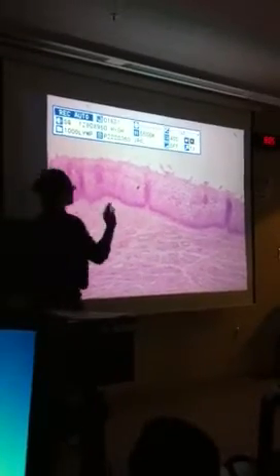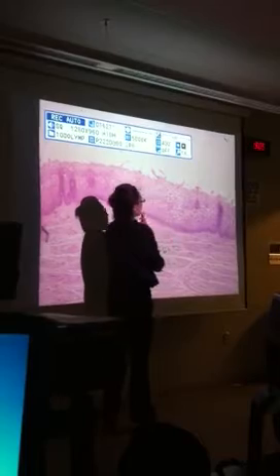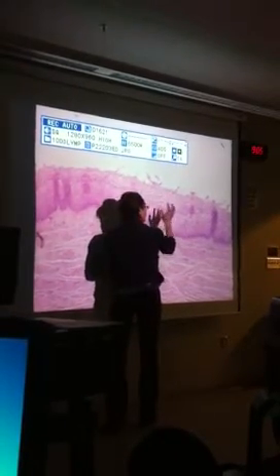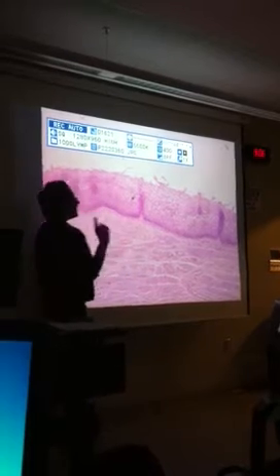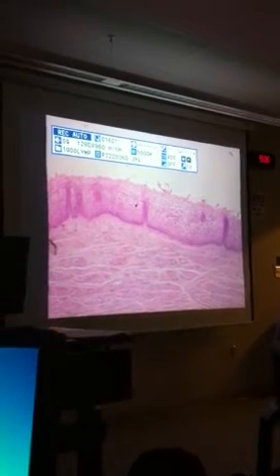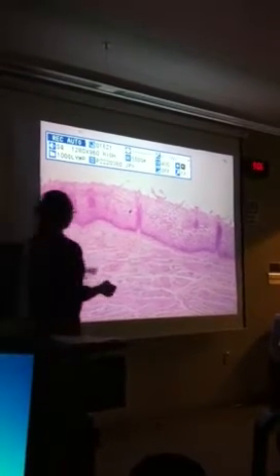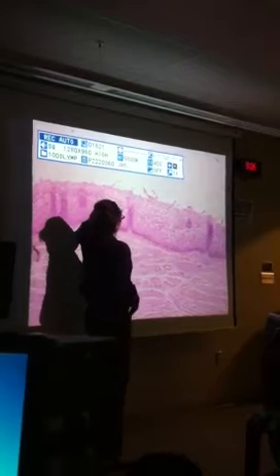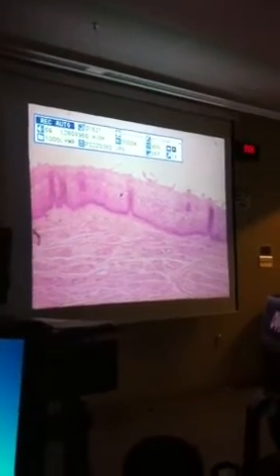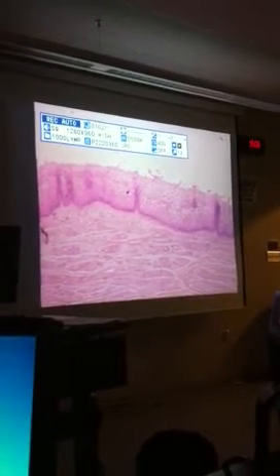But the key thing that you want to look for is, for the reproductive system, the only structure that has stratified squamous epithelia, that's the vagina. Now that, you should know stratified squamous because it's a key identifying feature of the vagina. So that I would definitely, if I pointed to that, you should be able to say that that's stratified squamous epithelia. Because it's stratified squamous epithelia, that's the vagina.